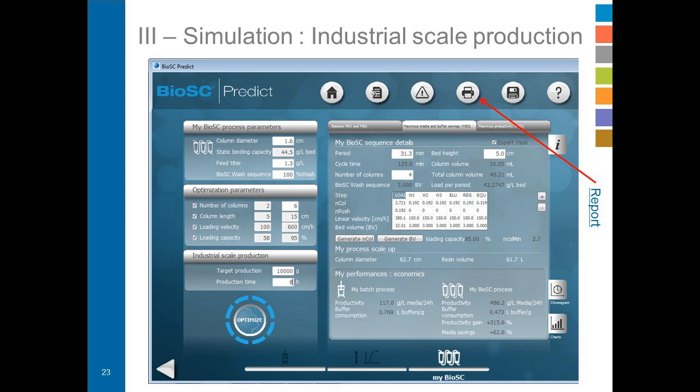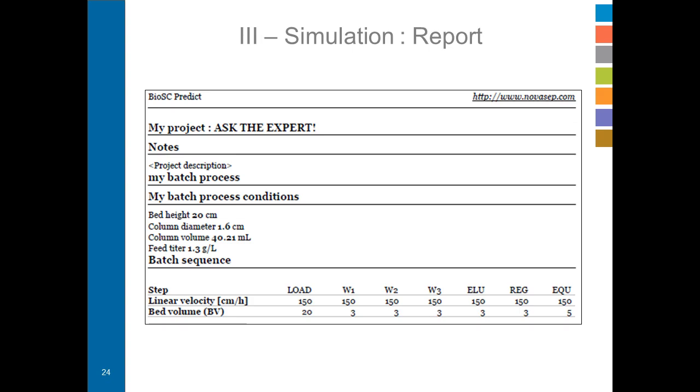Something I would like to show also is that for every simulation that you run, you will have a report where you can recover every piece of information that you have entered and that the software gives you. Let's go through a report.